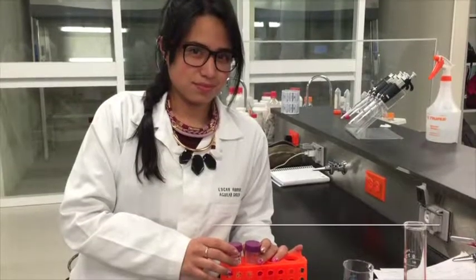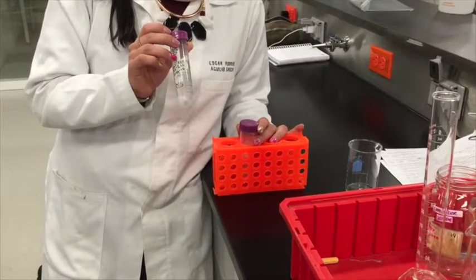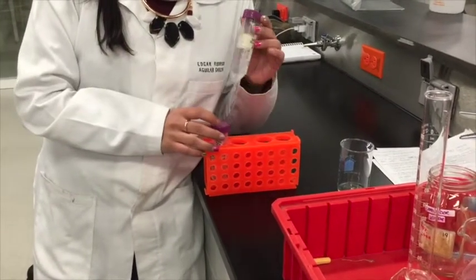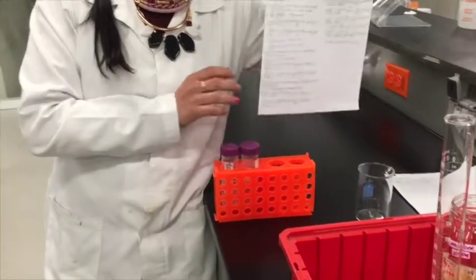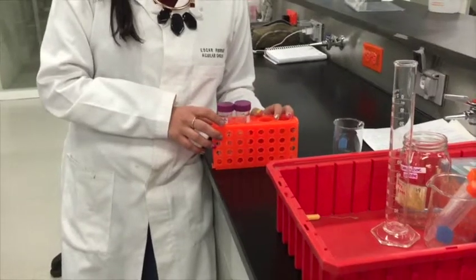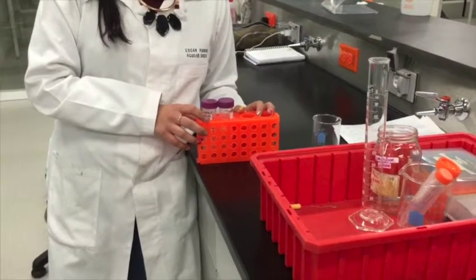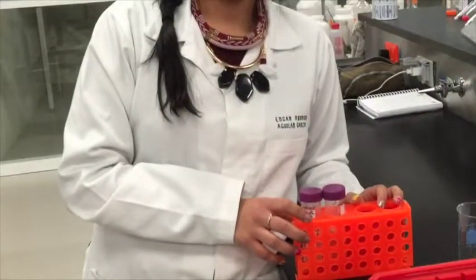In conclusion, we can say that it's very important to prepare a solution correctly. Align the equations we made to the knowledge of each reactant we use, including the preparation method, because in some cases the solution needs a specific pH or to be sterilized. You have to consider some aspects in the process of preparation of this solution, like the use of gloves and masks when it's necessary, and also clean or sterilized material.